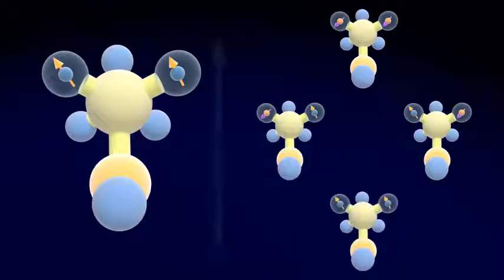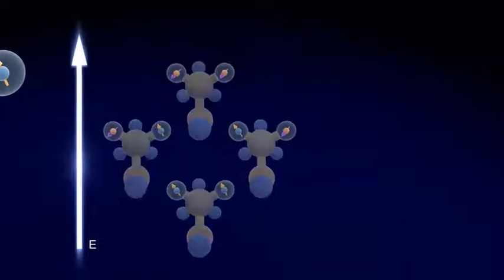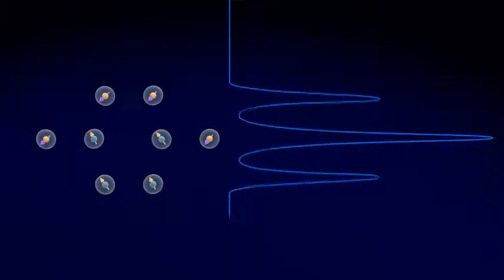Each combination has a different energy level and influence on the neighboring spins, except that up-down and down-up combinations have the same energy level and influence. The influence is visible as a splitting of the signal of the methyl group into 3. This is called a multiplet.